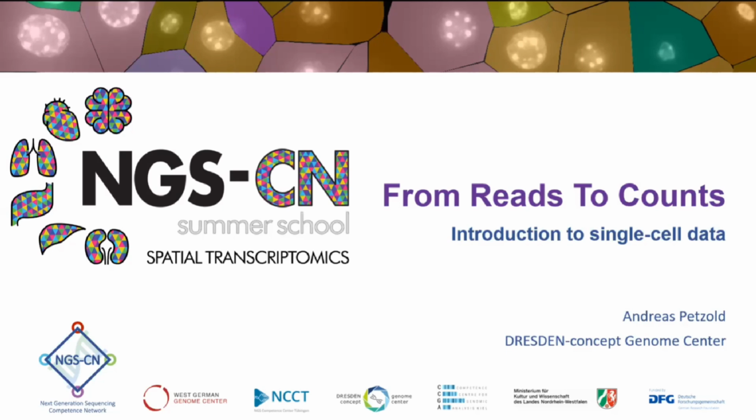Today I will talk about this step and explain some basics about how to convert reads into counts, what mapping is, which pipeline you use, how the pipeline converts the data, and so on. Please note, this is basic bioinformatics. So when you are new to single-cell data analysis, this is a good introductory talk for you.